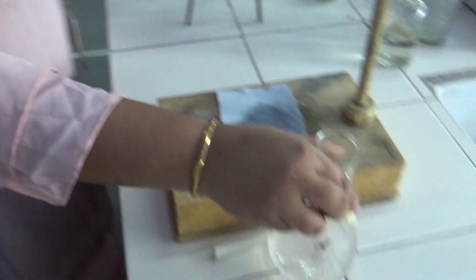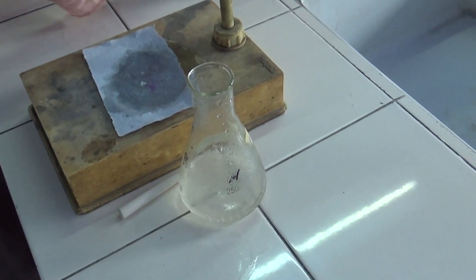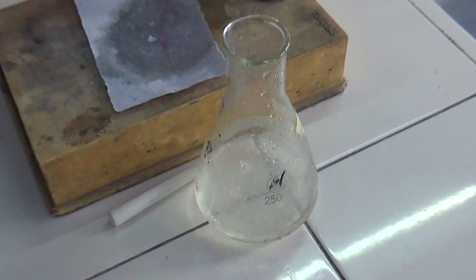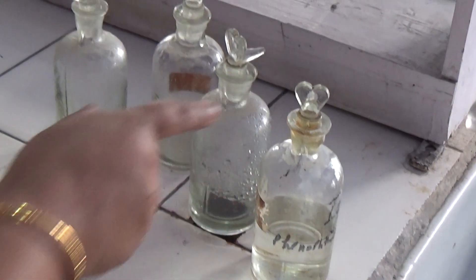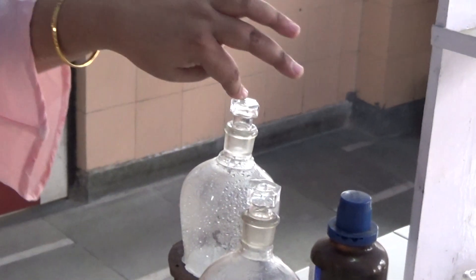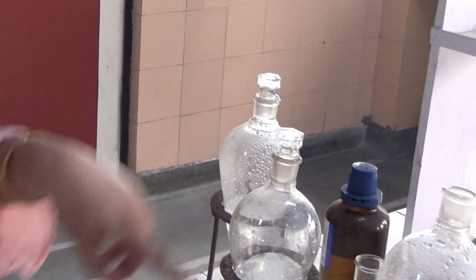Similarly, you will be doing the titration for both the other reagents: 1 gram, 1.5 grams, and 2 grams of benzoic acid. Same titration procedure.